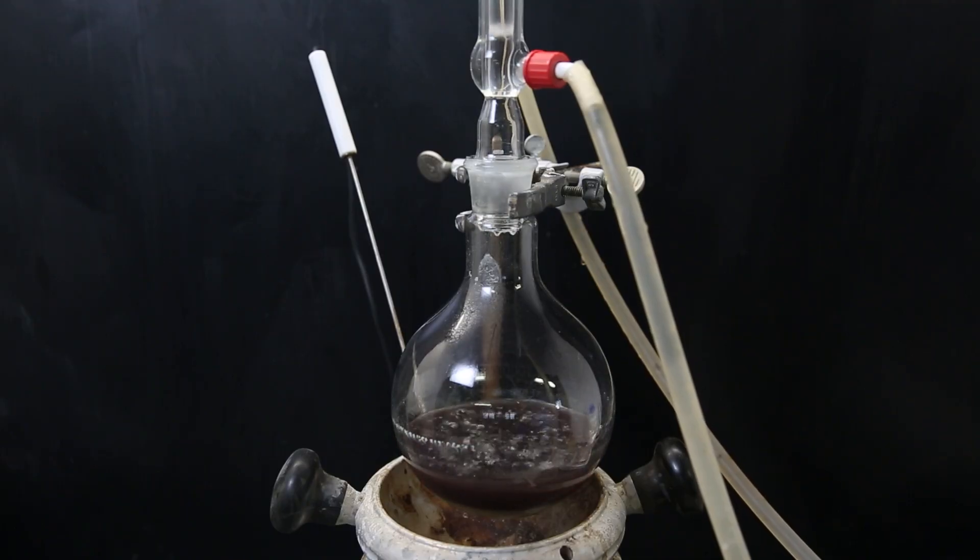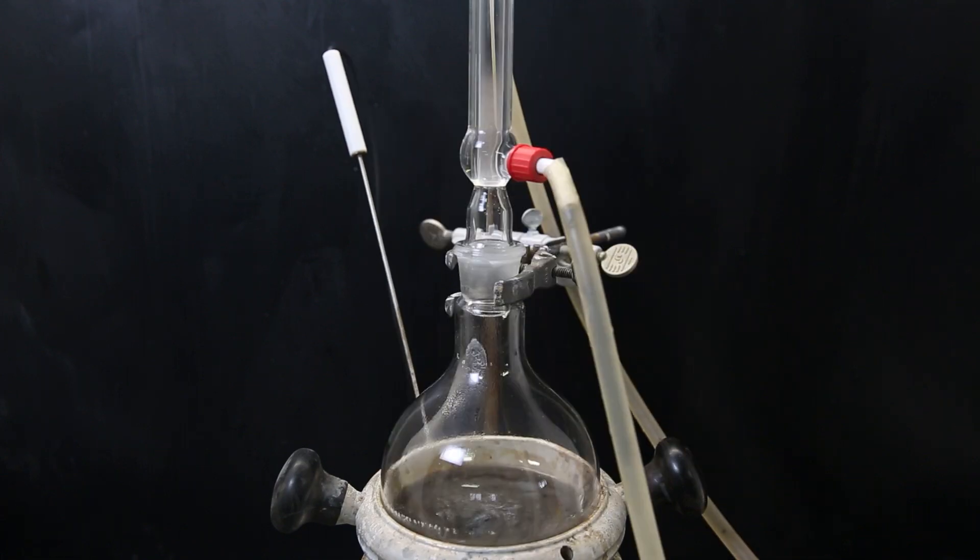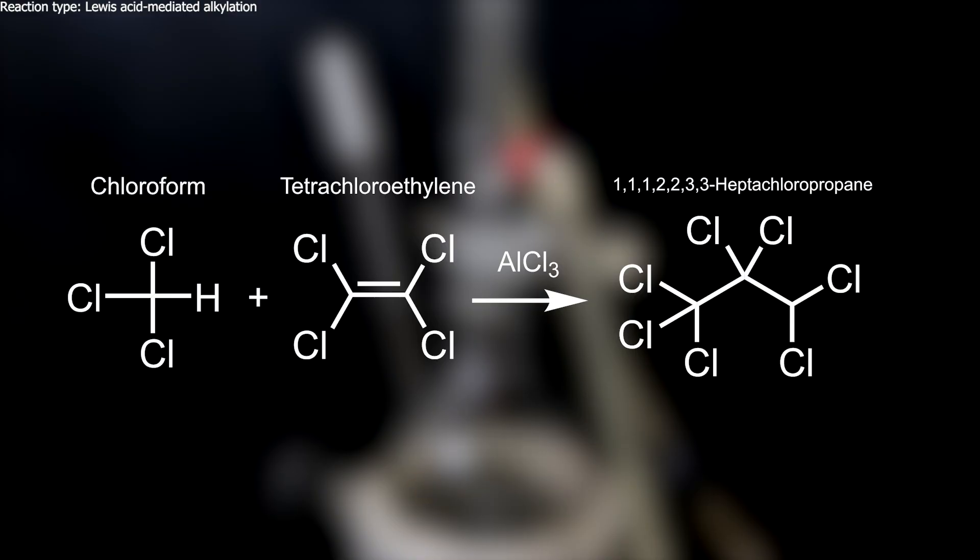After a while it tames down and I set it back in the heating mantle and let the mixture reflux overnight. In the reaction, aluminum chloride catalyzes the reaction between chloroform and tetrachloroethylene to form 1,1,1,2,2,3,3-heptachloropropane.